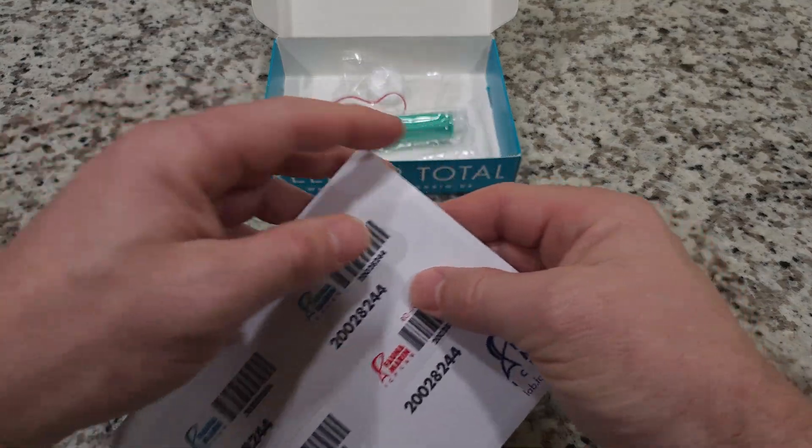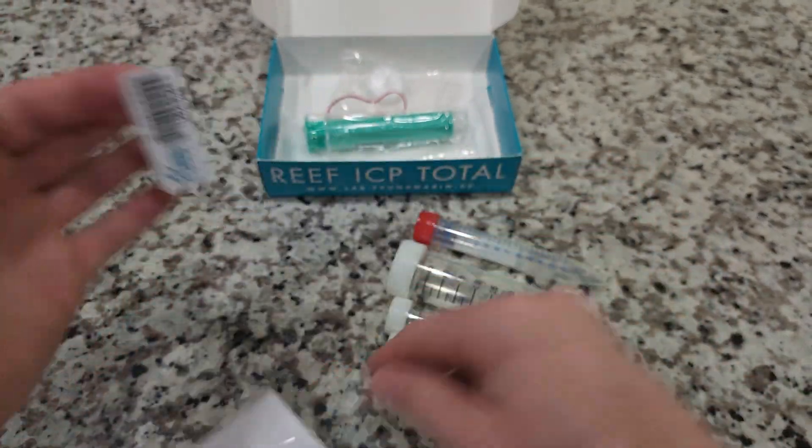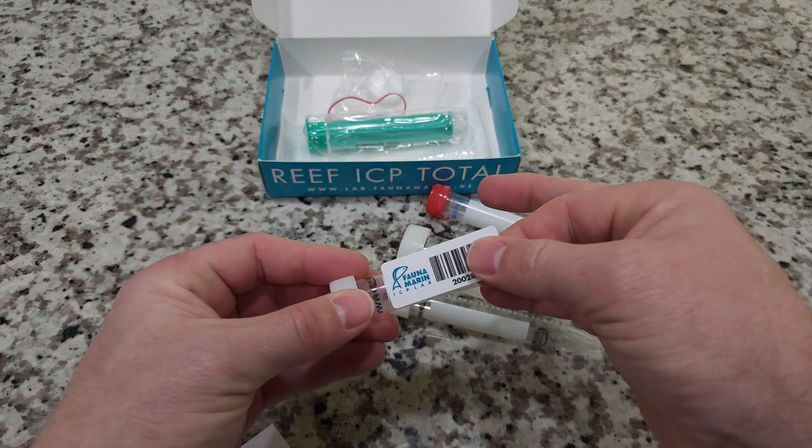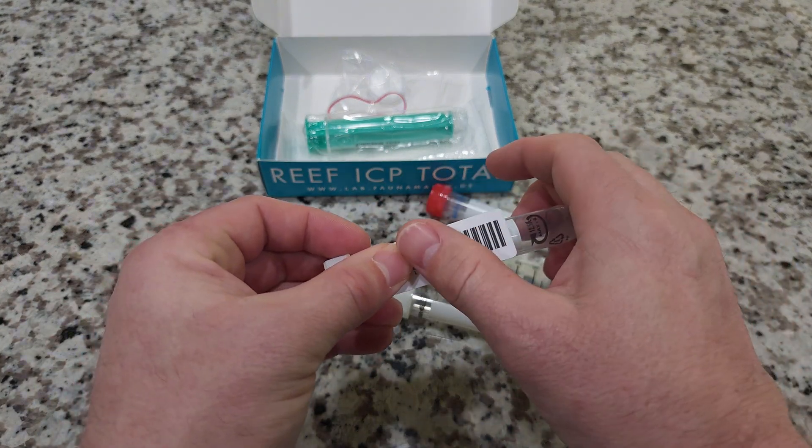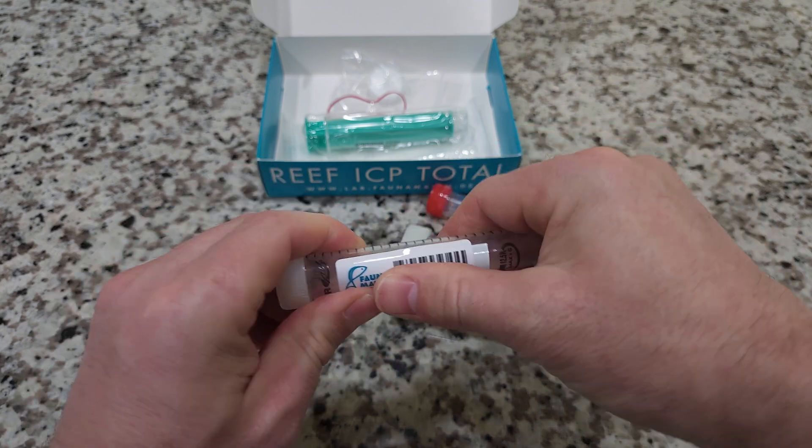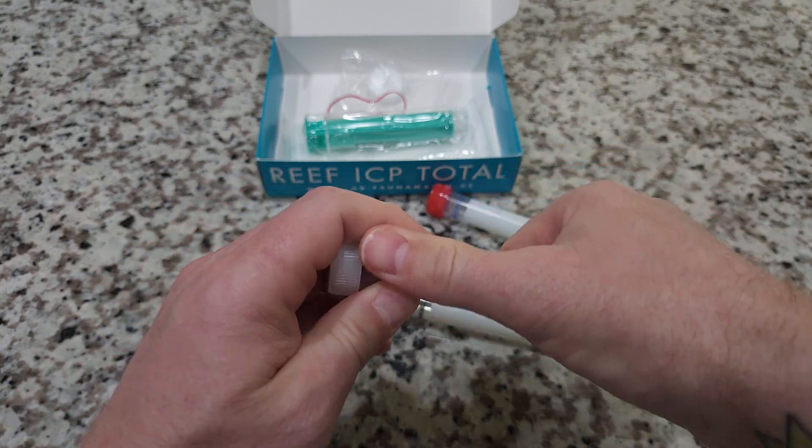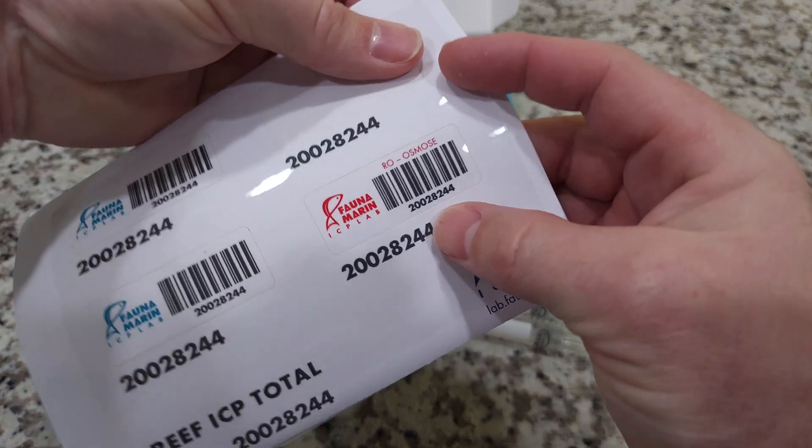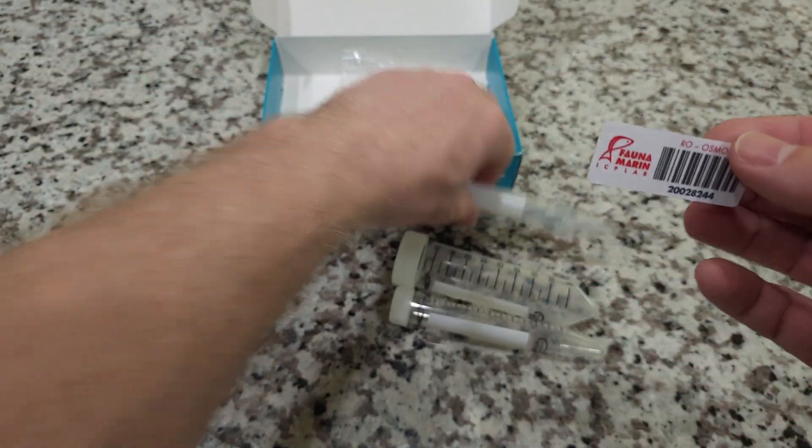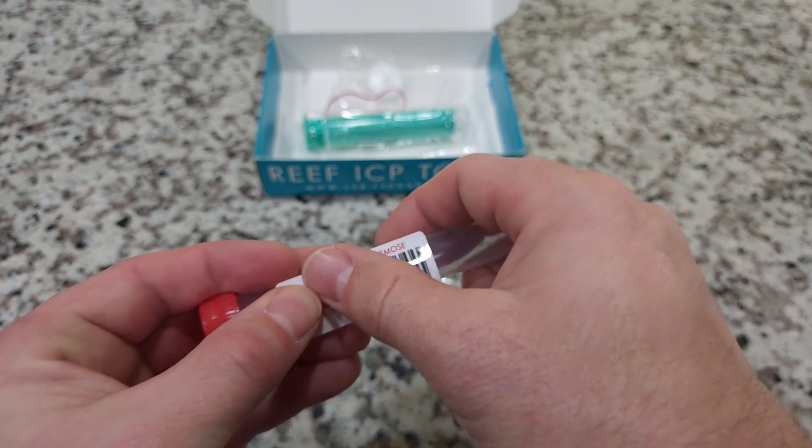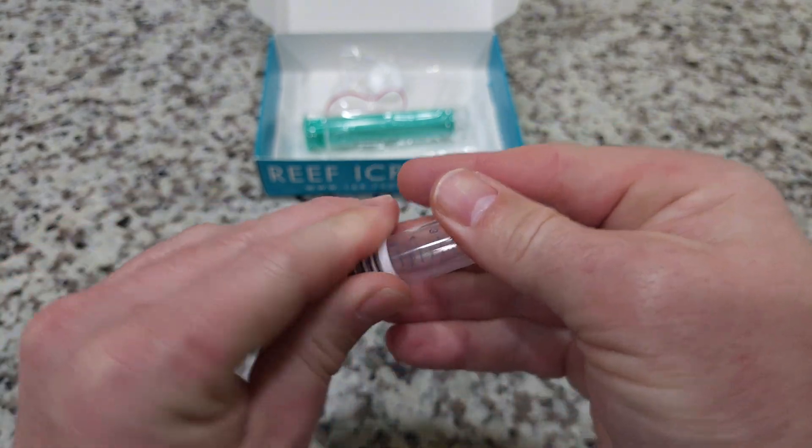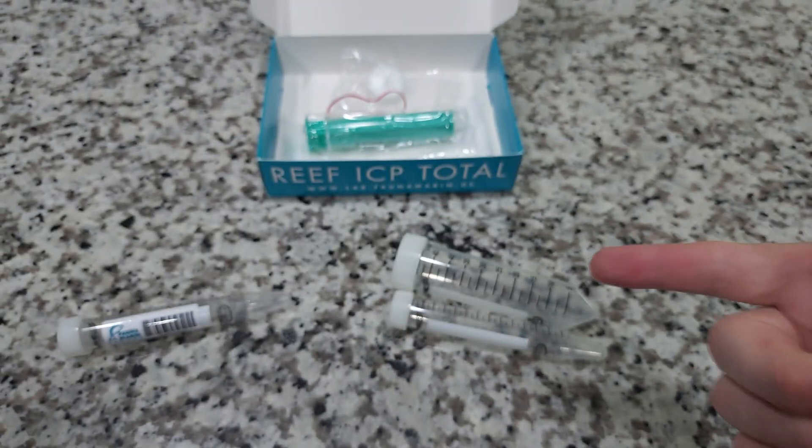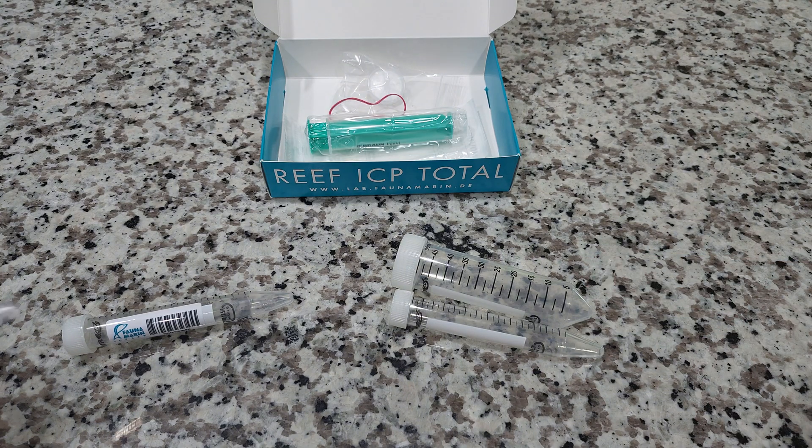We're going to take our labels, pull them off just like that and affix them to the side of the tube. Make sure they're stuck down really good. They're not going to come off. Like I said earlier, the red one is for reverse osmosis so you'll use the red label to fix onto that tube. Mine's a little crooked but I'm sure that will be just fine. Do the other two and we're good to go.